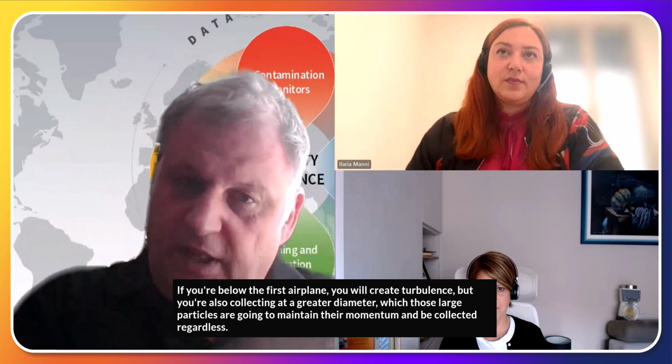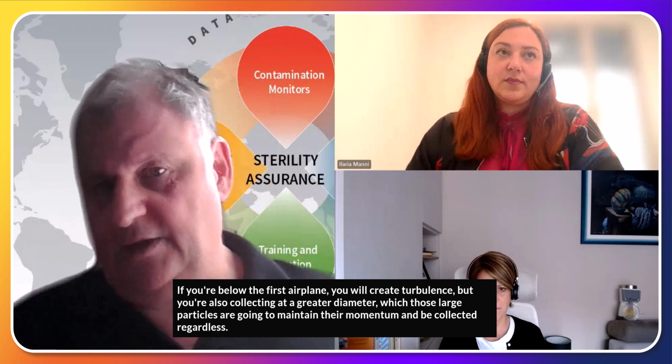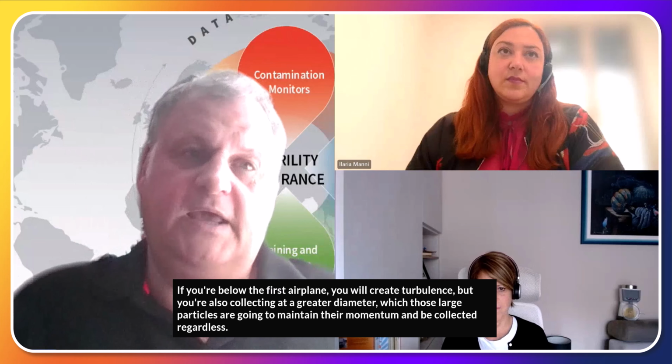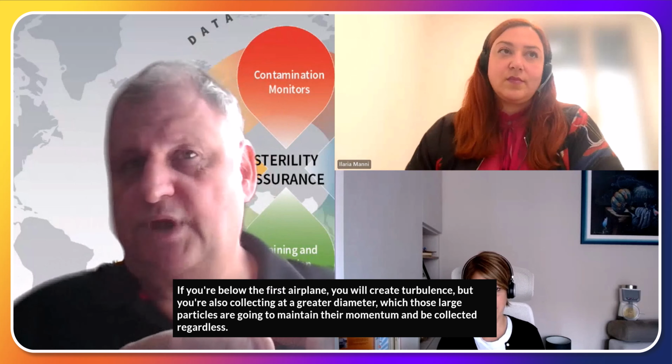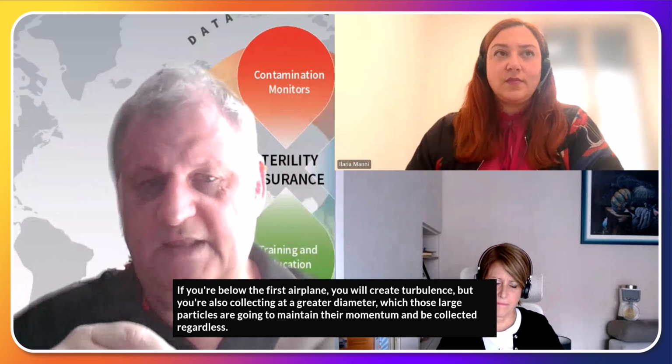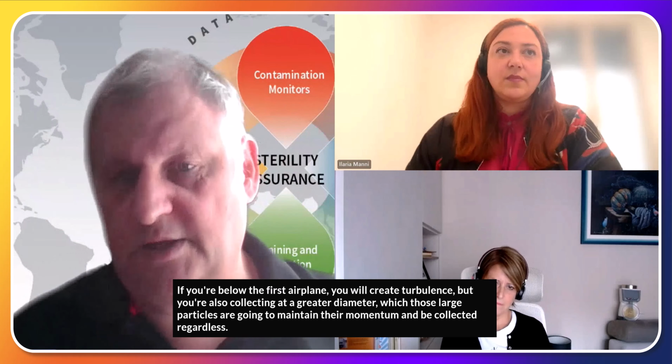So it's not critical. In fact, quite the reverse happens. The wider the collector, if you're below the first air plane, you will create turbulence, but you're also collecting at a greater diameter, and those large particles are going to maintain their momentum and be collected regardless. We're still going to collect.